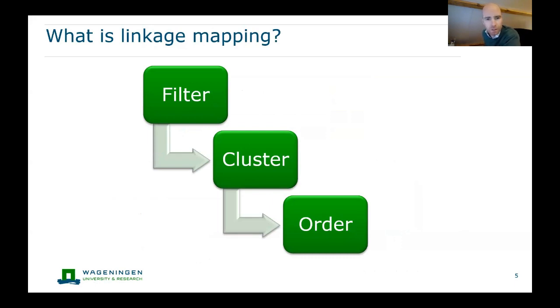The data is then clustered into chromosomes and linkage groups. Once we have that information, we do an ordering step using MDS map as well. So we're relying on the same MDS algorithm, which is an extremely fast solver for this optimization problem, finding a good order. And within that process, we also estimate the phase, so we generate phase information as well.